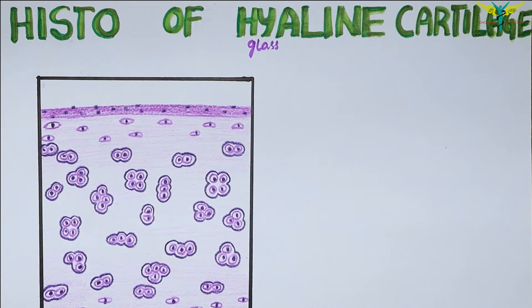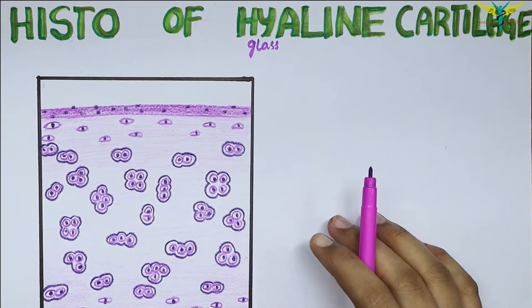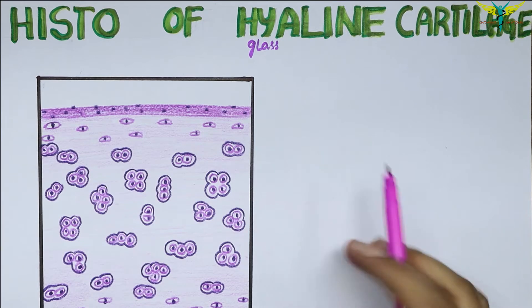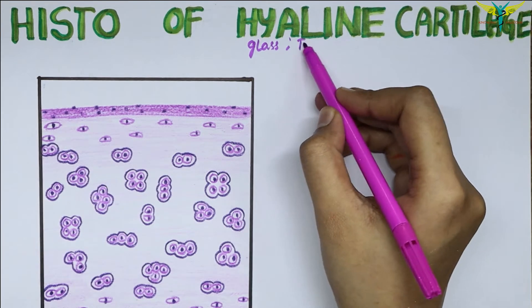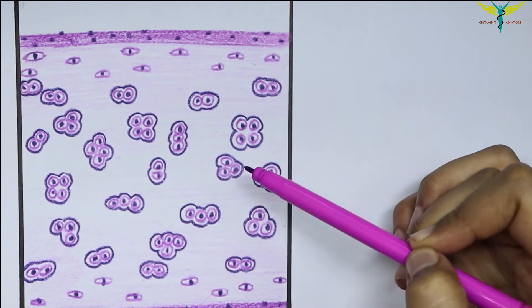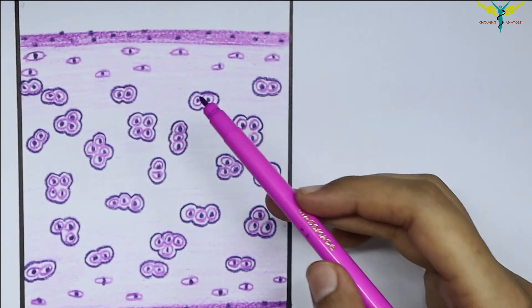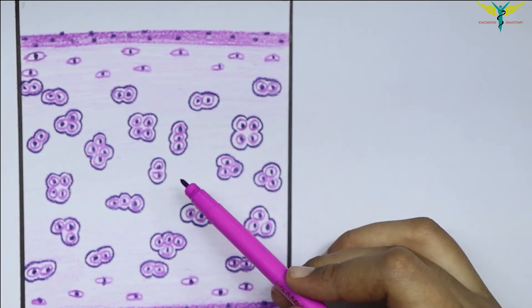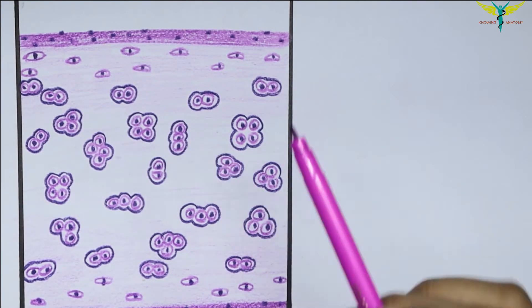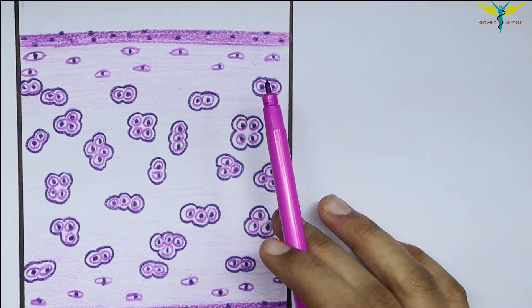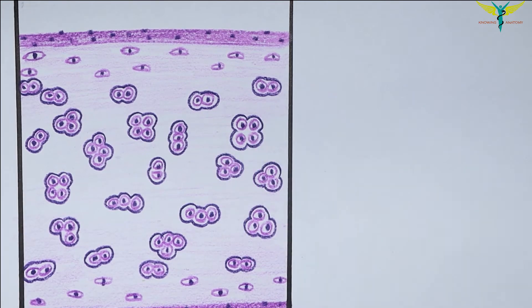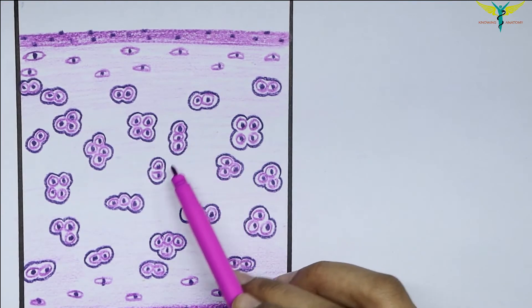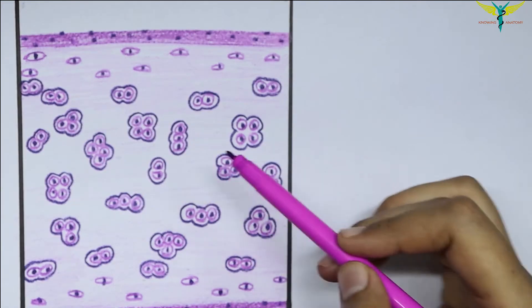These collagen fibers are arranged to resist the tensional forces, and the hyaline cartilage has been compared to a tire. Towards the center of the mass of the hyaline cartilage, the chondrocytes are large and are usually present in groups of two or more. These groups are formed by division of the single parent cell, and these cells tend to remain together because the dense matrix prevents their separation.